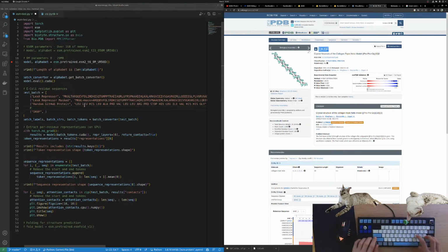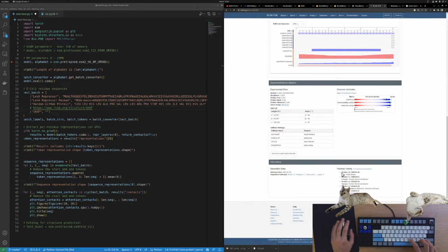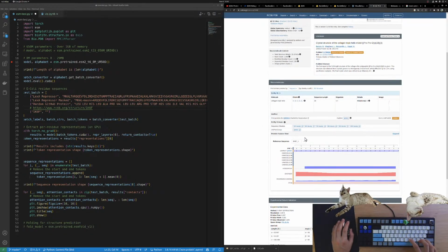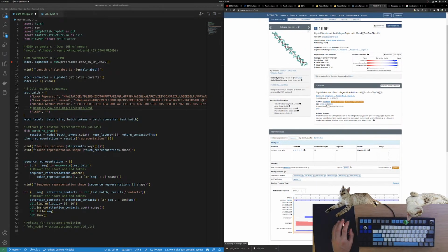Maybe we'll link to this Protein Data Bank here, and see if we can copy the sequence here, the residue sequence. There has to be some fast way to copy the sequence on this website, right? I feel like that's kind of the whole point.